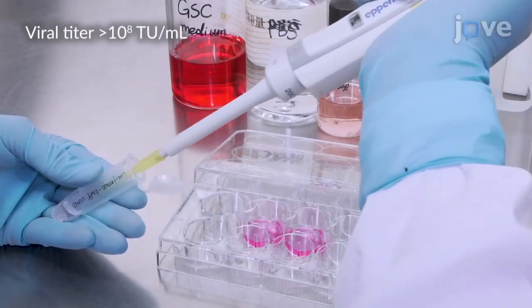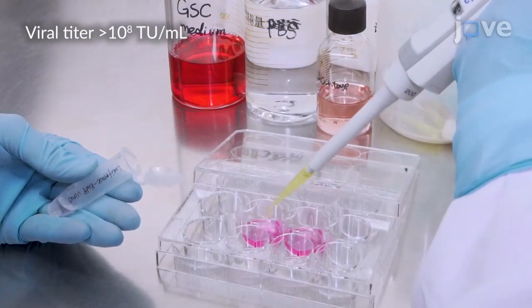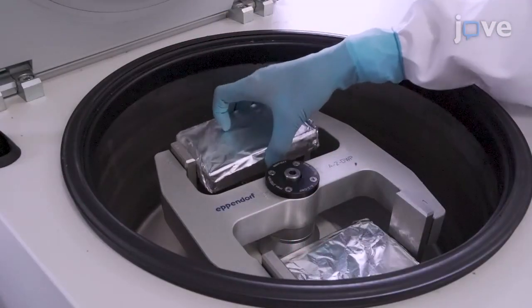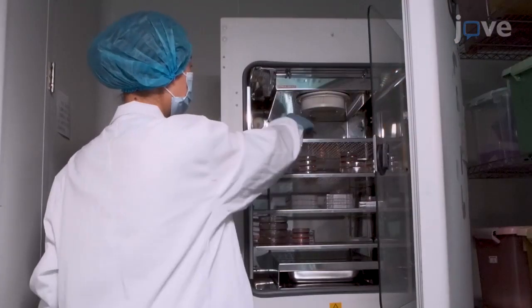On the next day, add 30 µL of luciferase EGFP virus supernatant into each well of the plate. Centrifuge the cells at 1,000 times G for 2 hours at 25 degrees Celsius and incubate them overnight.